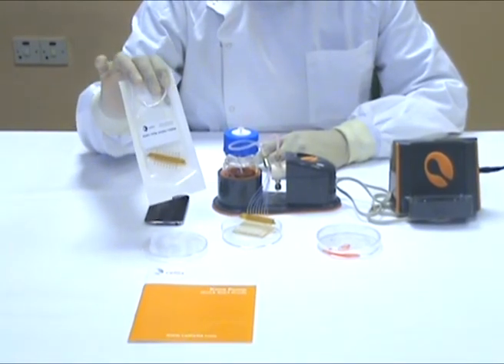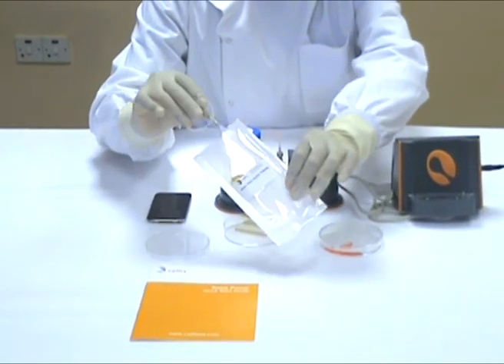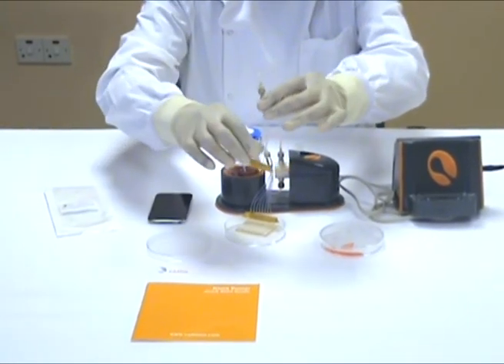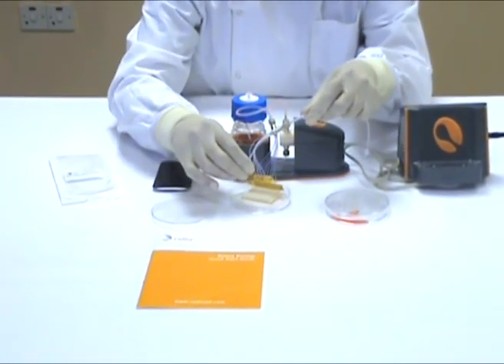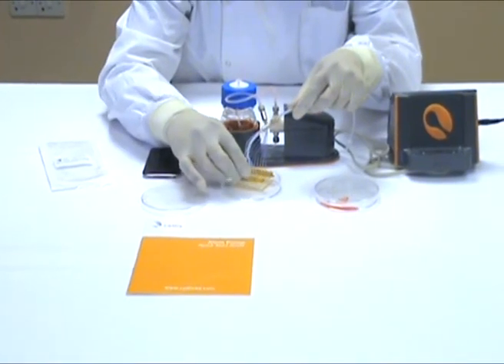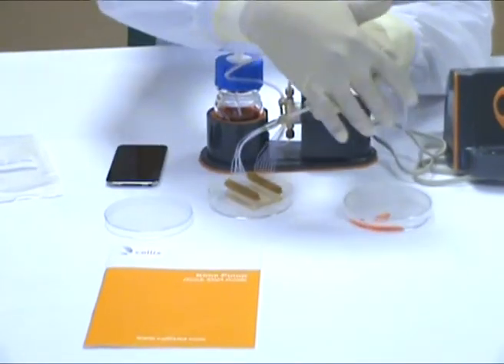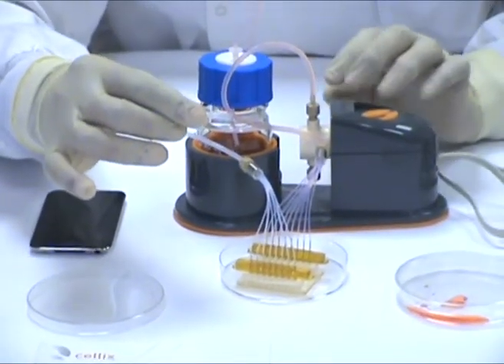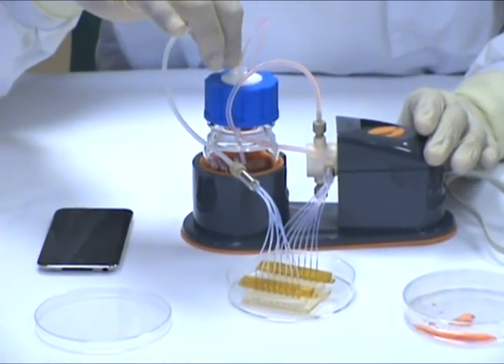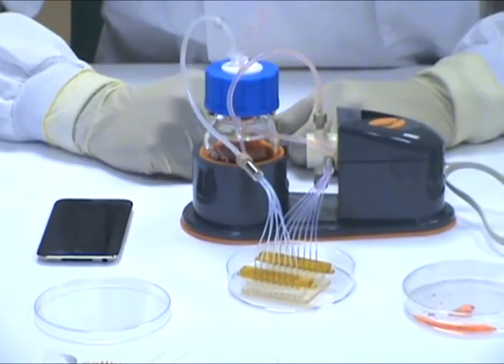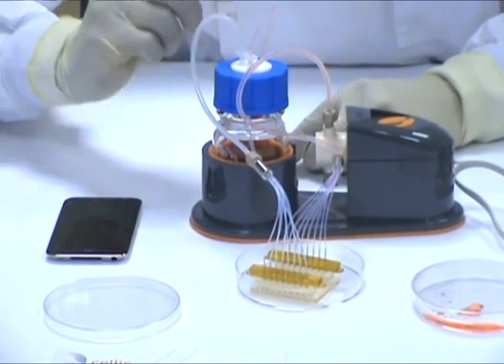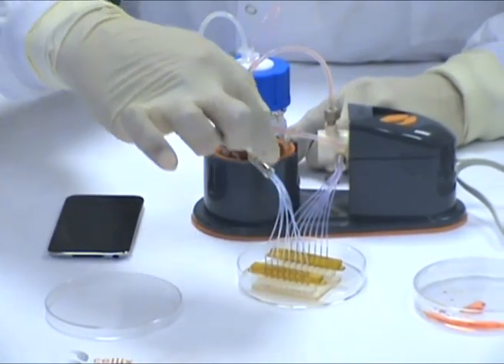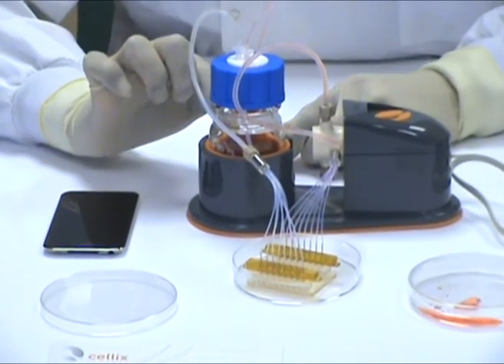Now take the chip outlet tubing. Connect it to the other side of the chip. The other end of the tube goes back to the bottle. So this is the way the media is recirculated through the tube to the chip. And from the output of the chip, it goes back into the bottle.